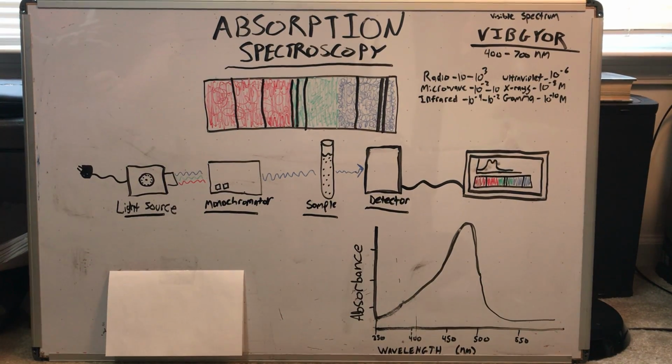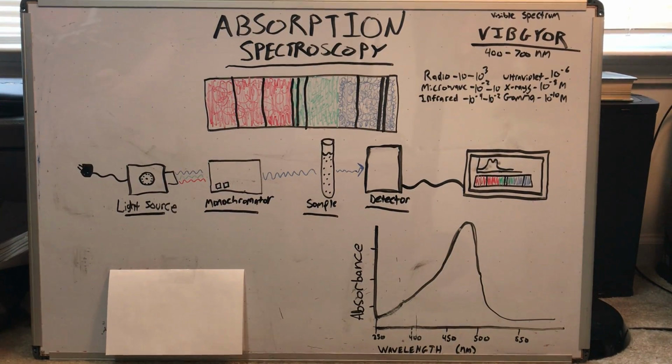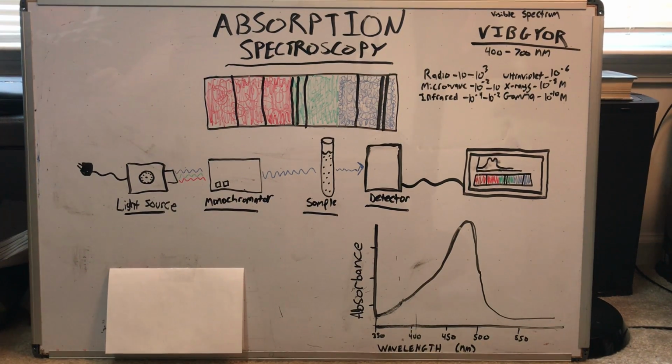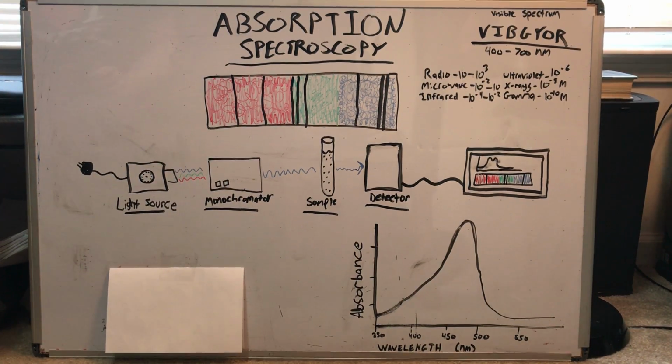Hello classmates, my name is Mark Gilkerson and I've put together this video to help explain the general concept of absorption spectroscopy. The following will be a general overview of how this absorption spectroscopy works and how the technique is performed.